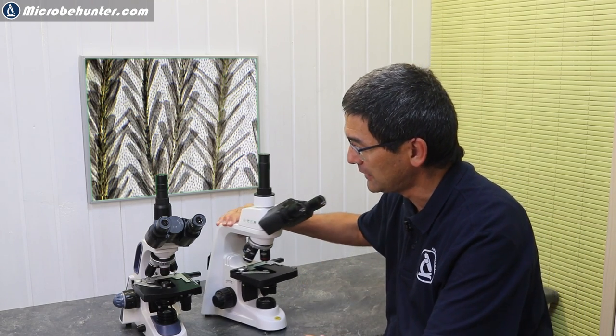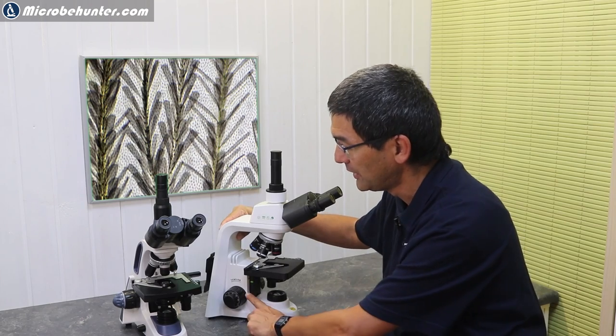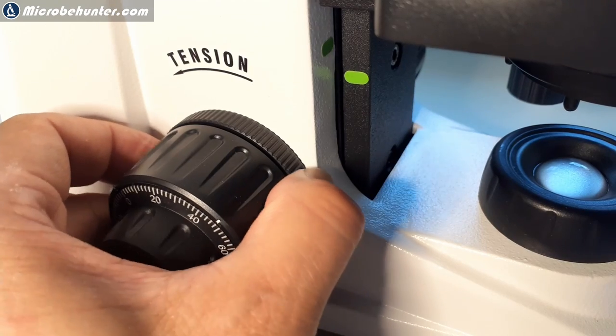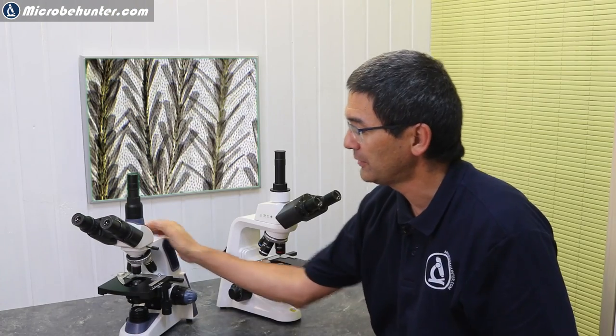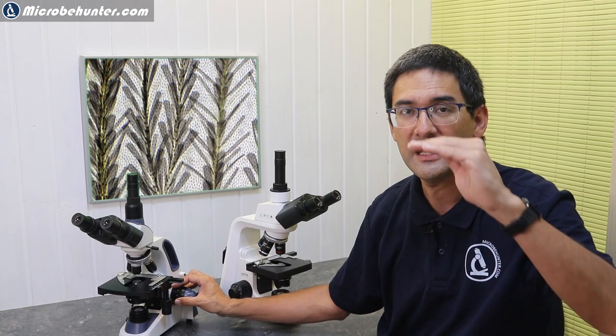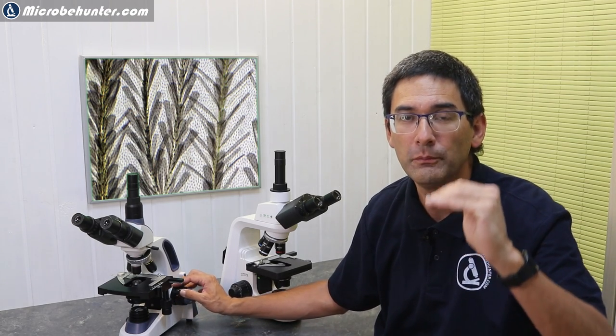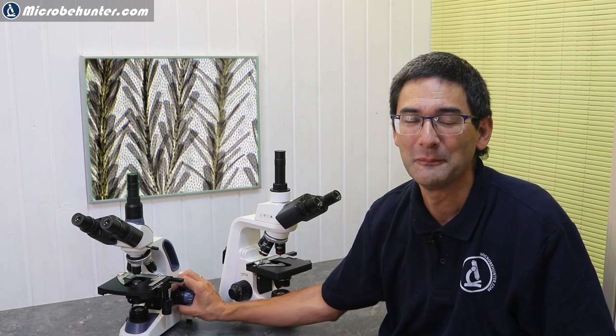Both microscopes allow you also to adjust the tension of the coarse focus knob. It's done a little bit differently. Here on the Stellar One you actually see it on the left side—there is a ring that can be turned to adjust the tension. On the other one, there is a ring on the right side. If you feel that the stage lowers down due to its own weight, then you know that you have to increase the tension a little bit more by turning this tension wheel.